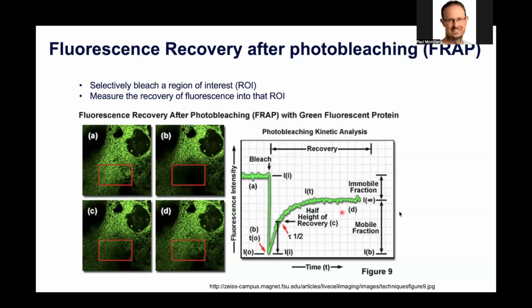So we've got a couple of things here. We can measure the half-time of the recovery, so how fast that recovery is happening. But we can also quantify the percentage of the mobile and immobile fraction of those molecules within your sample.